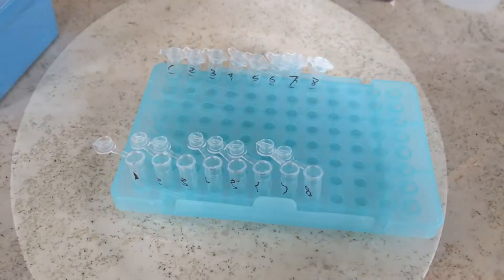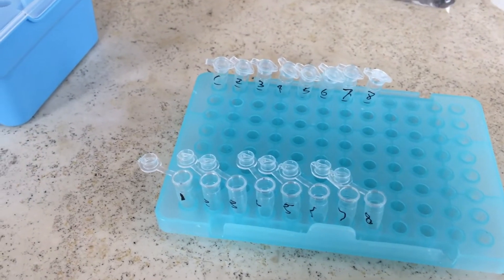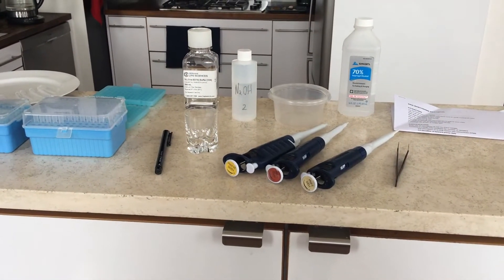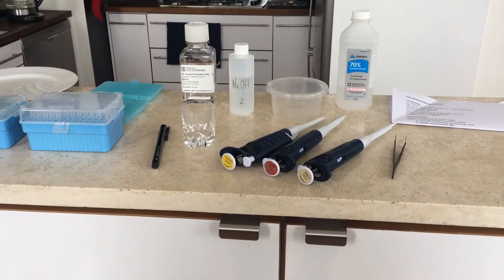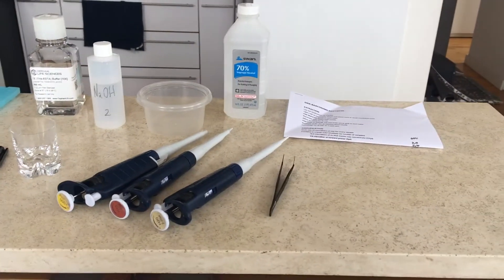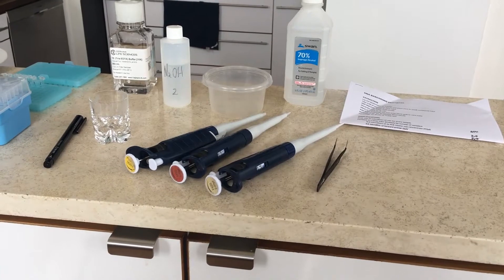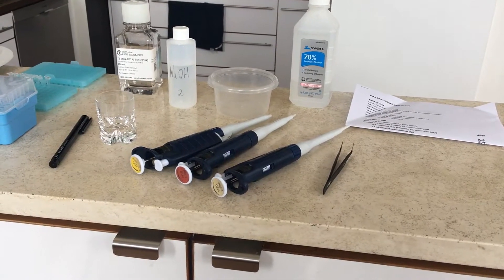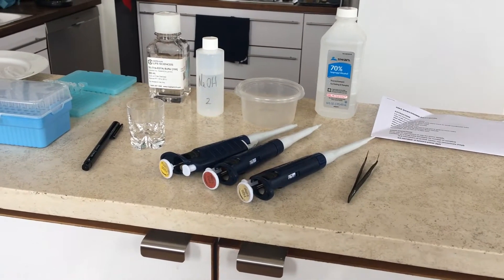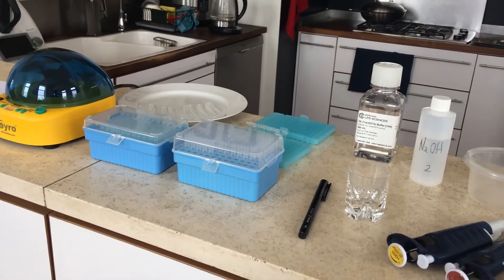Here are my eight little pestles that I just made myself. Here are my labeled tubes — it's two sets of eight. The ones in the back I keep closed because you don't want anything to get in there that could interfere with the PCR. Now we're ready to get started with the extraction part of the process.